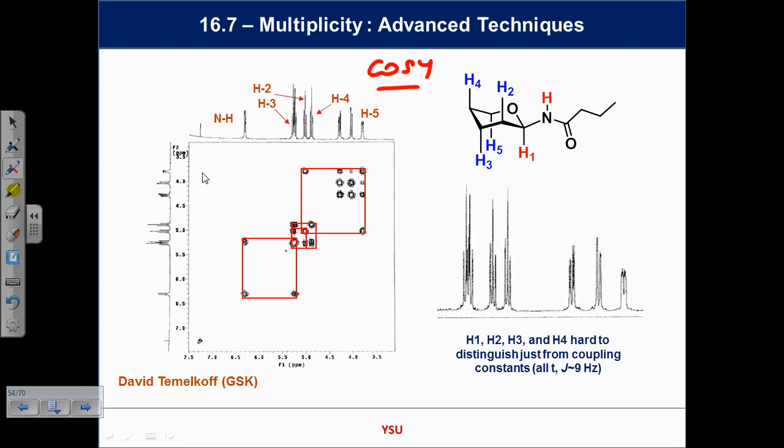And so you'll get this sort of mapping possibility, where if you can find H1, where was H1? The NH is over here. You can map that to H1, you can map that to H2, and you can actually spell out exactly which one those belong to. Some of you will end up doing this maybe in biology, if you go to graduate school in biology or biochemistry, and that's the sort of basis of that technique.